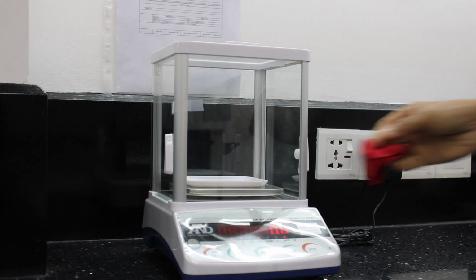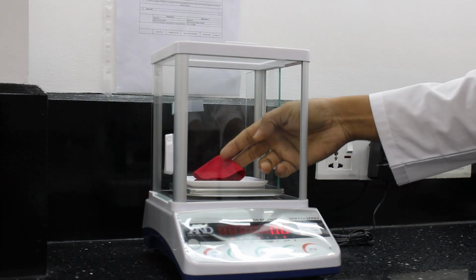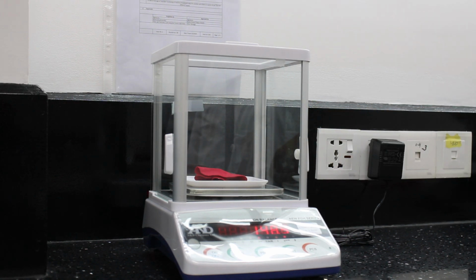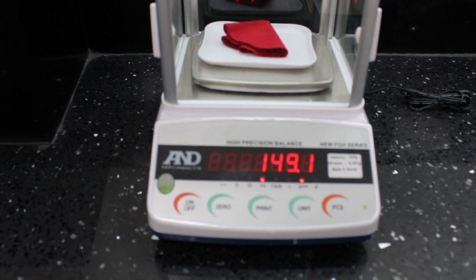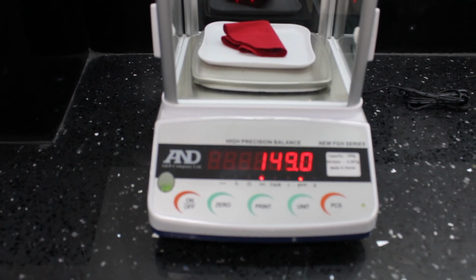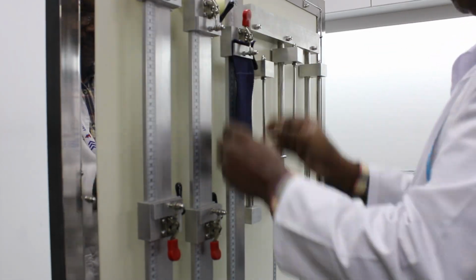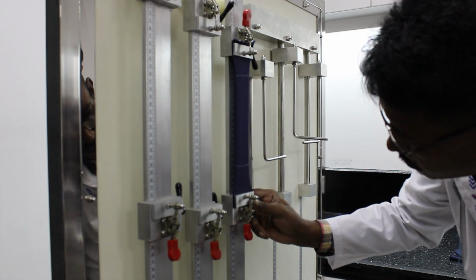Course and wale count. Courses and wales per inch are measured by placing a 1-inch glass on the fabric. Yarn size. The yarn size is a measurement used for the number of 840-yard hanks per pound. Stretch recovery testing evaluates fabric stretch and recovery properties, crucial for performance assessment.